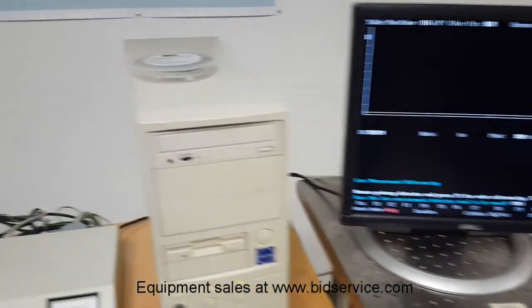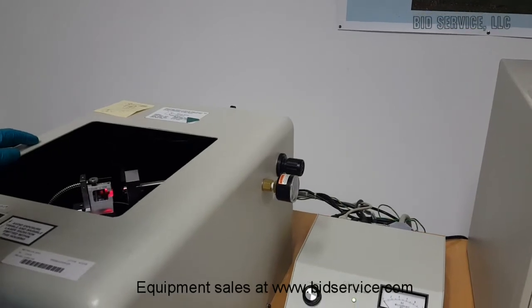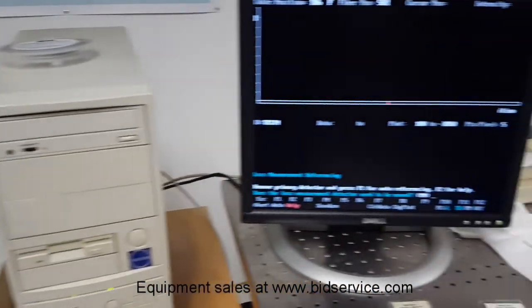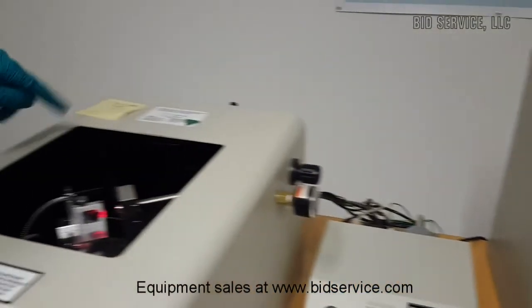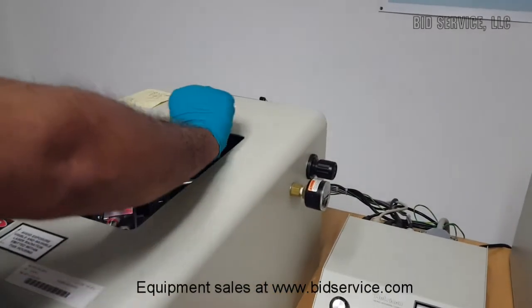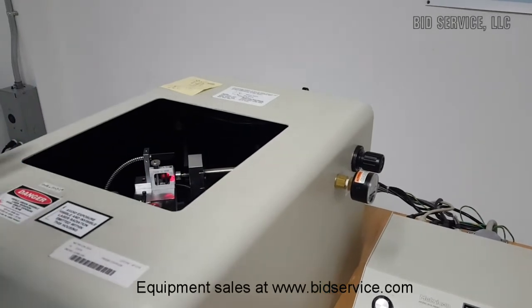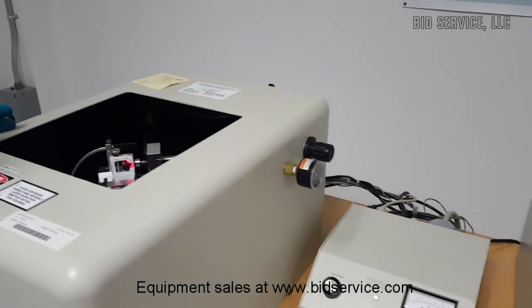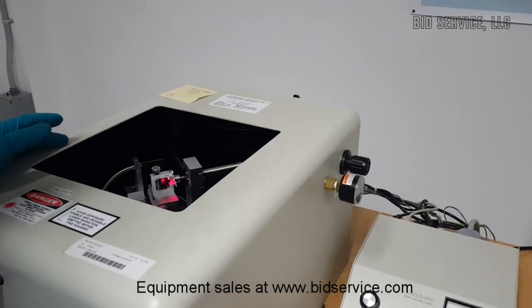Switch to prism coupler, and then it asks, does the loss measurement detector need to be moved? We say yes, so the detector will go out of the way. I'm going to reload my sample just to do the thickness measurement. I don't have a sample to do the waveguide loss measurements, so we assume that this unit is capable of measuring the waveguide loss.